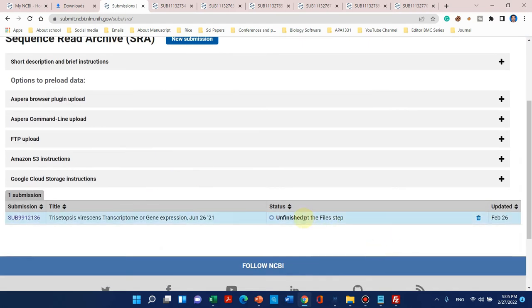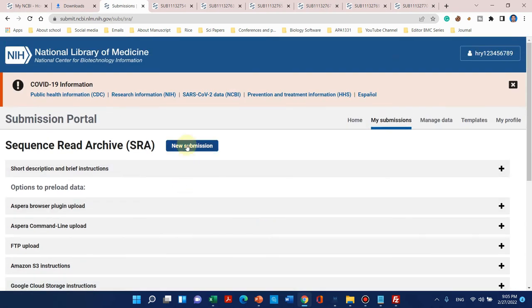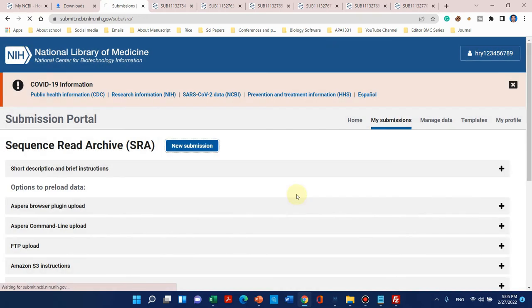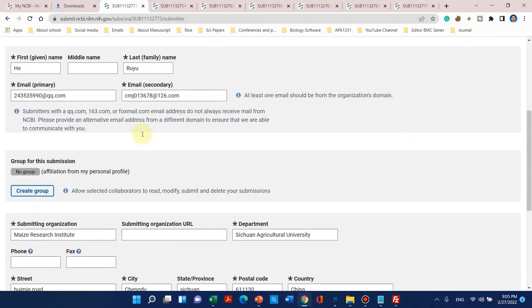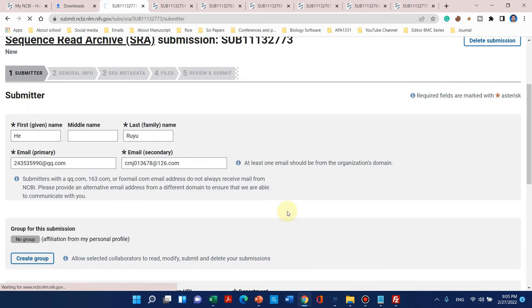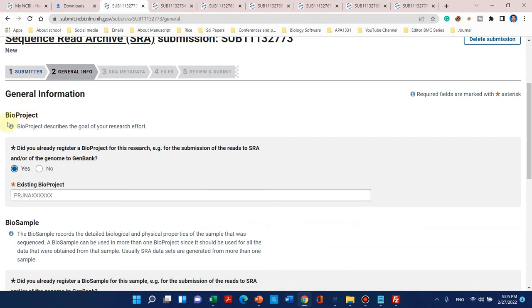We can start a previous submission or start a new submission — we will go with a new submission. The submitter information is the same as before, so we can leave it as such and continue. Here it is asking for an existing BioProject — this is why I told you we need to create a BioProject first, because SRA needs an existing BioProject.